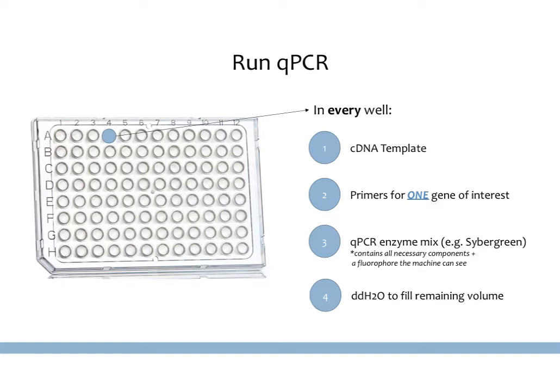So now we're ready to actually run the qPCR. And we will go through exactly how to do this in much more detail in the practical side of this lecture. But I want to give you a basic list of what needs to go into this qPCR reaction. So just like we understood our cDNA reaction, it's going to be important to understand the qPCR reaction as well so that we can know what needs to be ready. So in every well of a qPCR plate, you need to make sure that you have cDNA templates and an appropriate amount of cDNA templates.